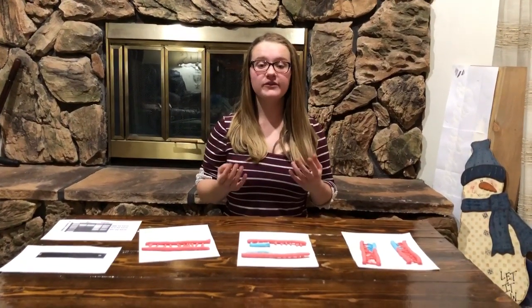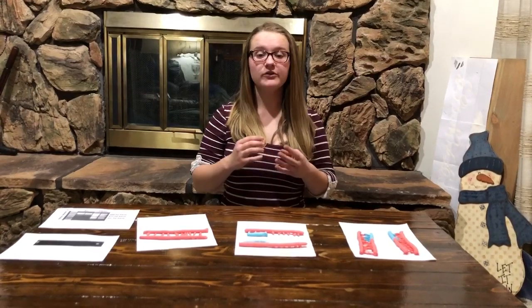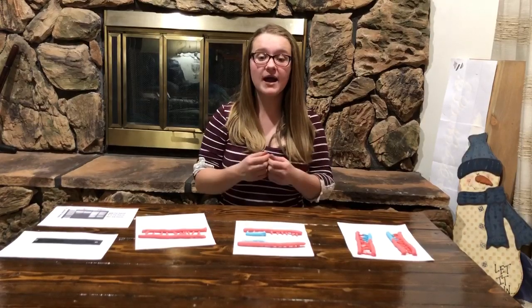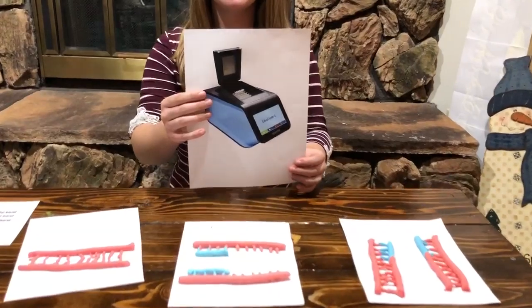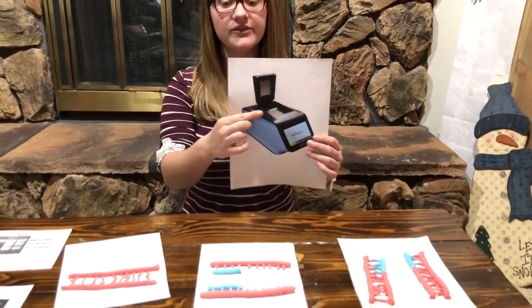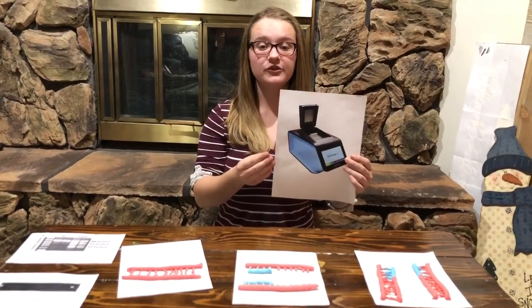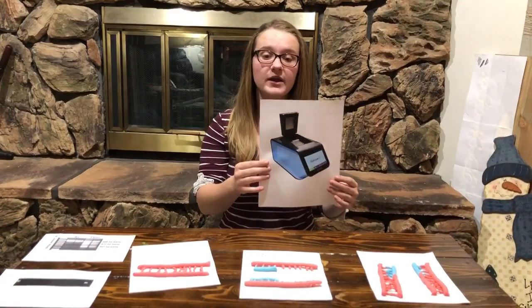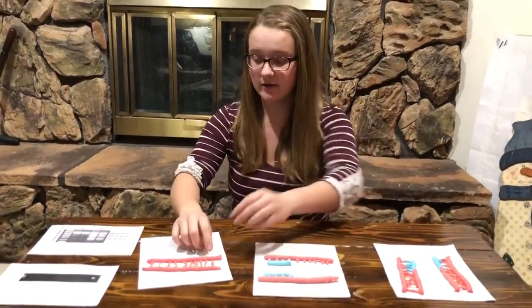All PCR uses the same process to recreate more DNA. The process all starts with the same ingredients: template DNA, primers, nucleotides, and DNA polymerase. All of these ingredients are combined and put together in a thermocycler. Within the thermocycler, there's a square receptacle that controls temperature. This container raises and lowers temperatures to control the temperatures of the test tubes containing ingredients that were put in the square container. The first temperature breaks apart the DNA.